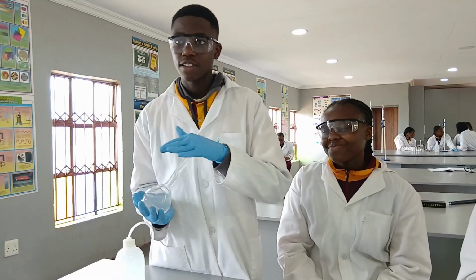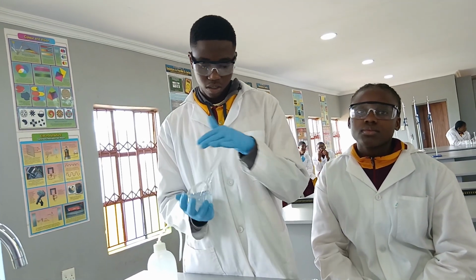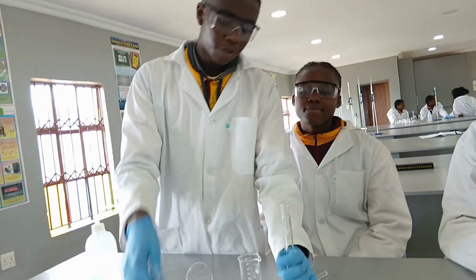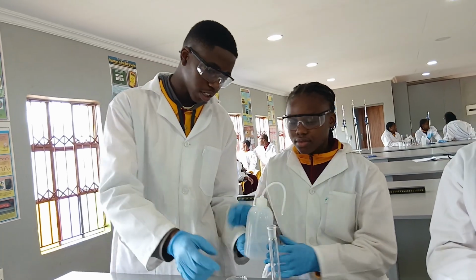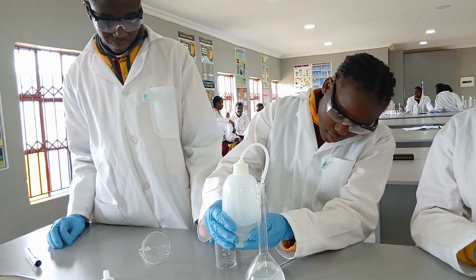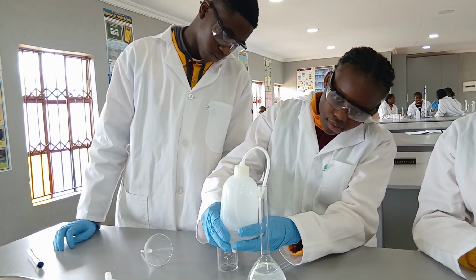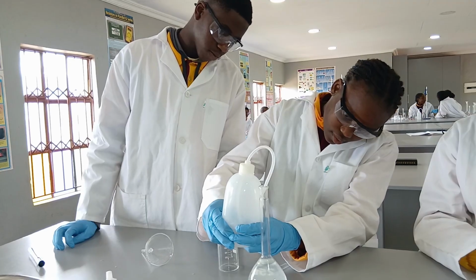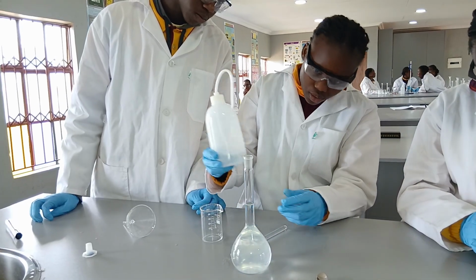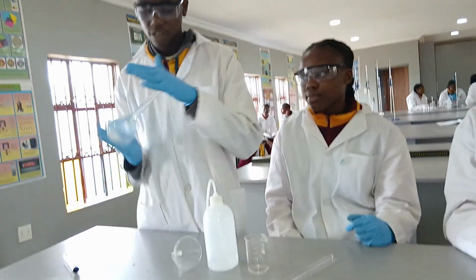Now we keep it for uniform mixing. Okay, we're mixing our solids until it reaches the required level. Mix.